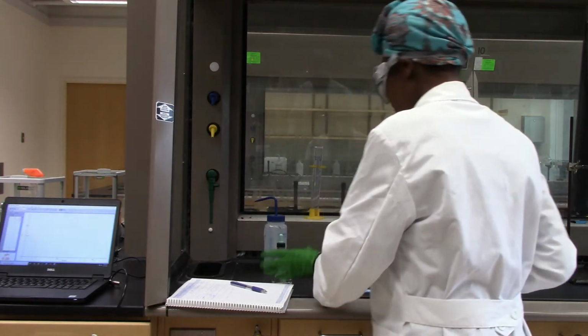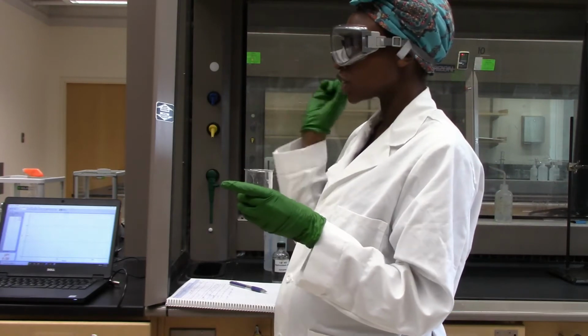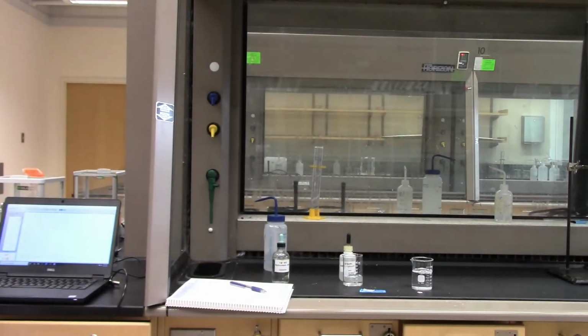So I will take my 50 mL of deionized water and obtain the pH reading for this using a pH meter. So here we go.